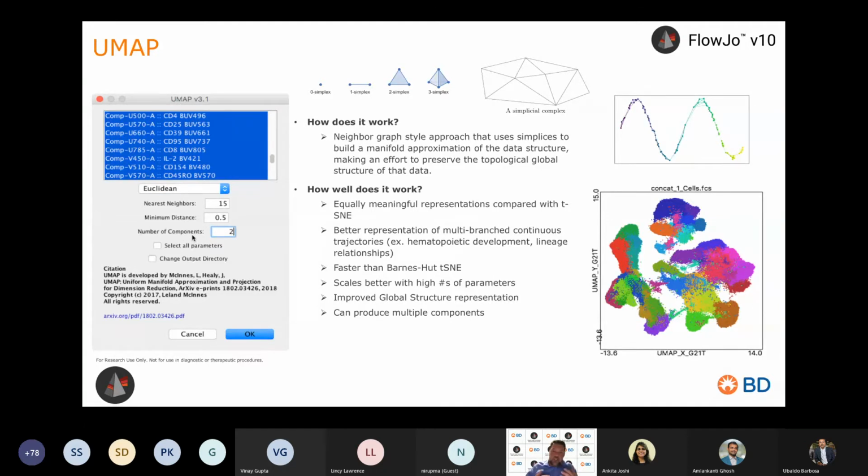Probably the easiest thing is to think maybe you need a z-axis. If you create 3 parameters, then you can look at x versus y, but then you can also look at x versus z and shift and turn the entire structure so you get a different representation of it. That can help with clusters overlapping in this UMAP projection instead of being flattened like you get in t-SNE.